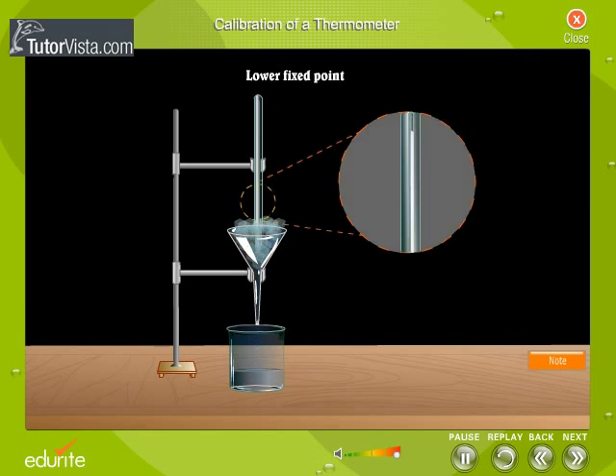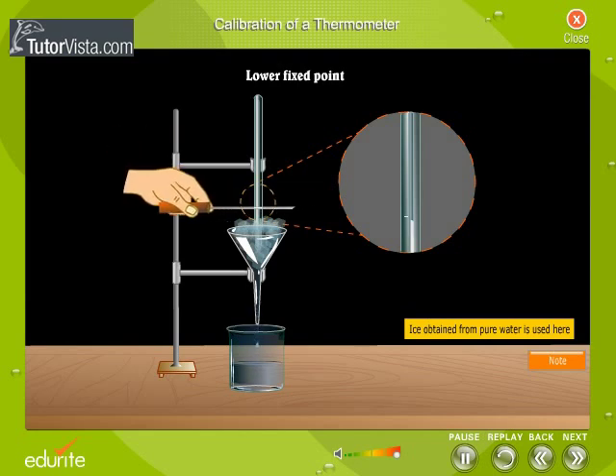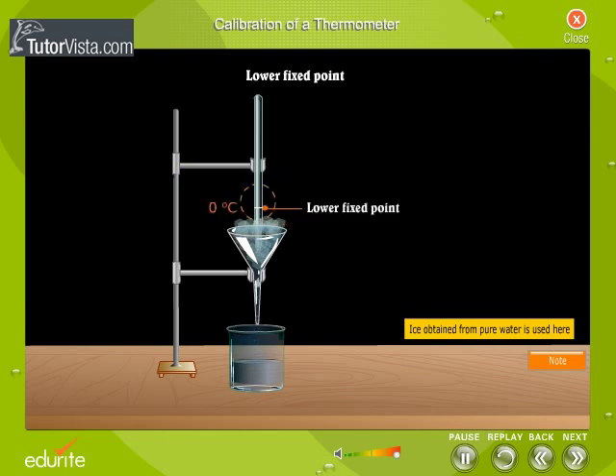Observe that the level of mercury is dropping. This is because the mercury starts contracting. After some time, the mercury stops contracting and the mercury meniscus remains stationary. This indicates that the ice is melting. The position of the meniscus is marked on the stem of the thermometer with the help of a file, and that point is marked as zero degrees Celsius. This position gives the lower fixed point or ice point.